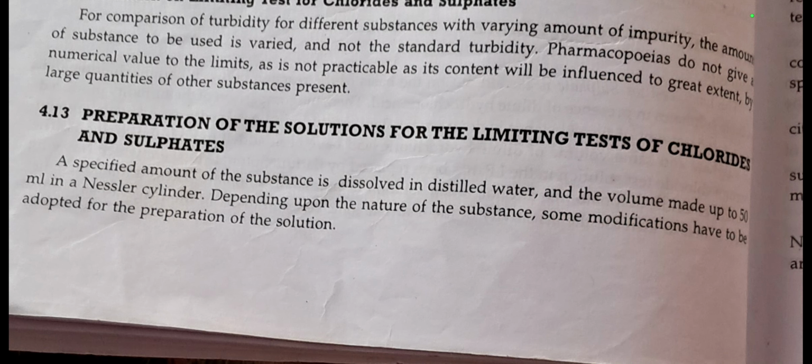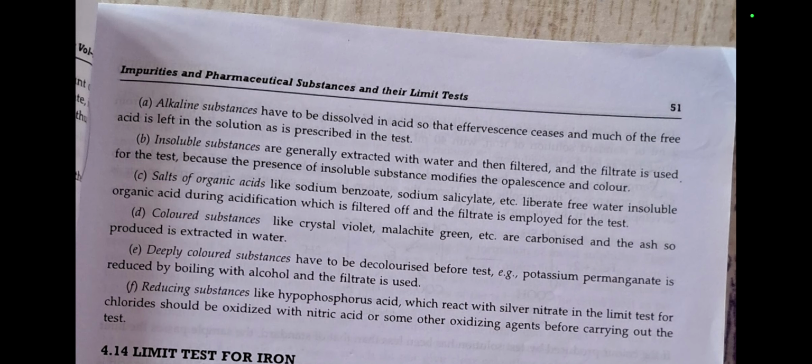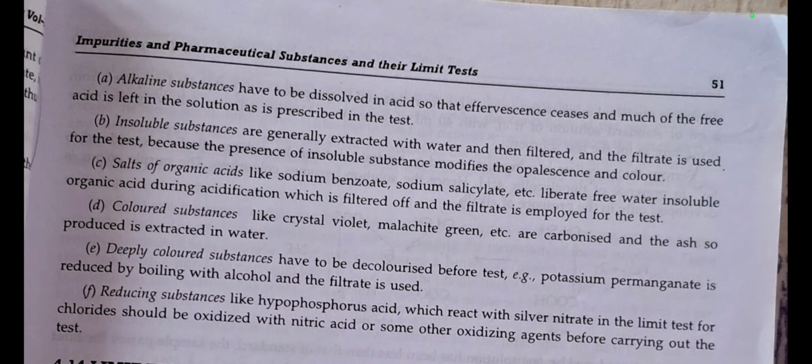How can we do the modification? Let's see one by one. In the case of an alkaline substance, it has to be dissolved in acid so that effervescence ceases and much of the free acid is left in the solution, as prescribed in the test. So first it is dissolved in acid until the effervescence stops, and after that it is used as the test solution.